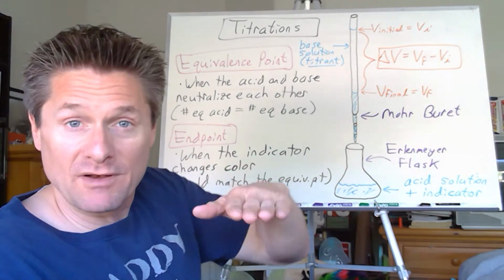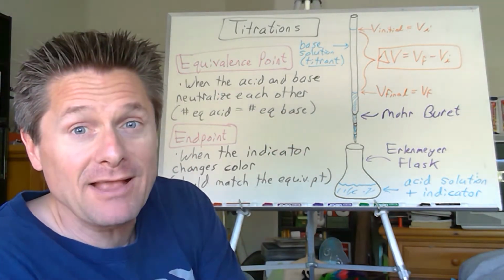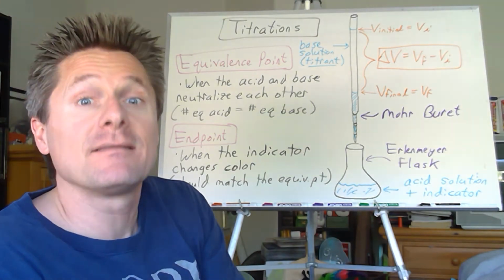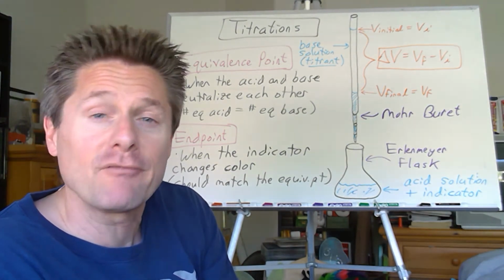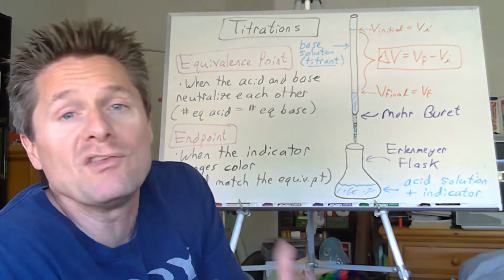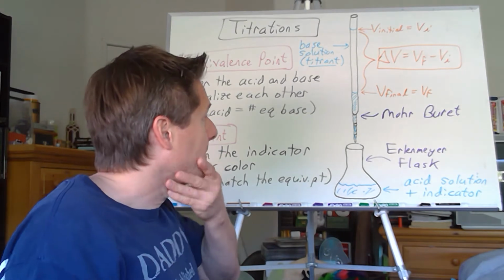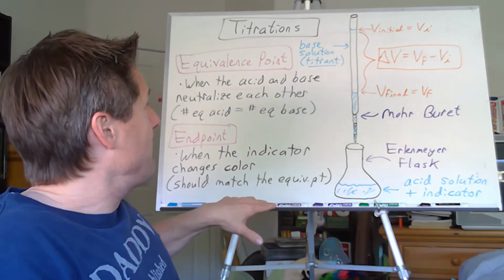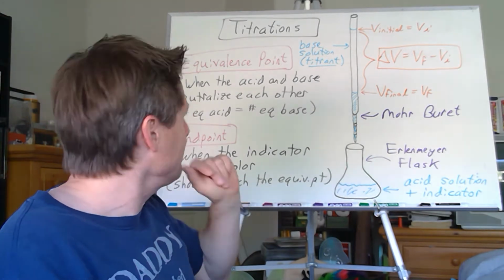But as we're going to find out at the higher level here in second semester general chemistry, there are lots of different kinds of titrations, and some indicators don't work that you would think. Phenolphthalein might not be the best indicator for some titrations. It's just we've always used it for the classes we've done because we've done simple titrations. All right. So pretty key factor there. So swirly, swirly, swirly, get the faintest pink color possible.